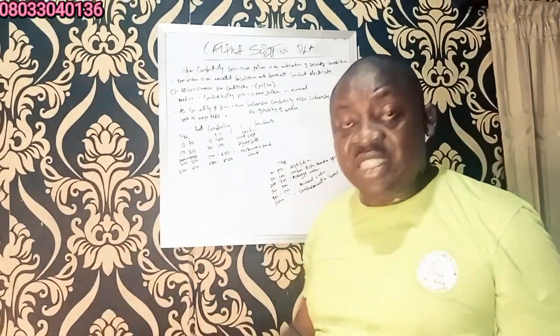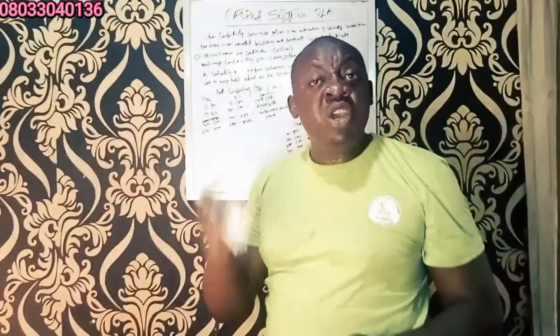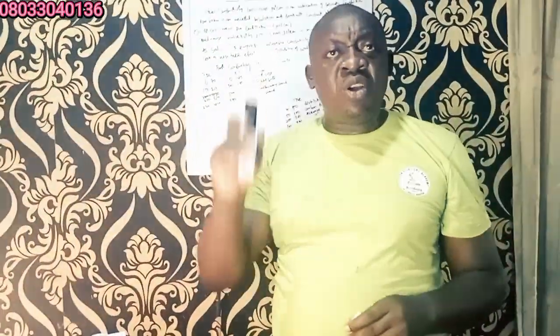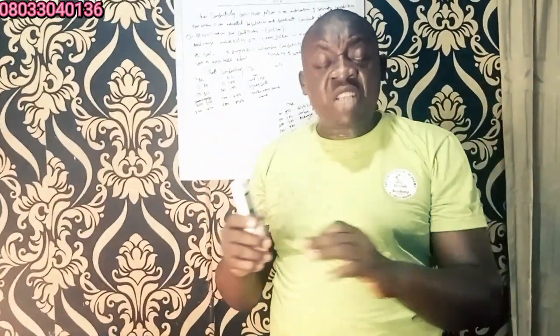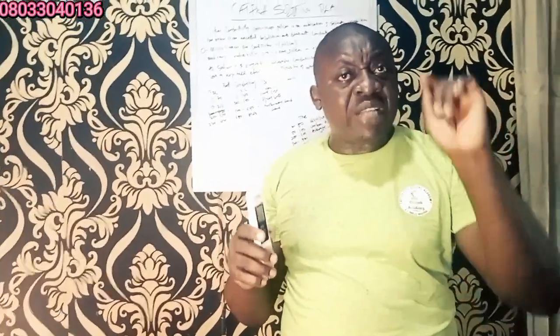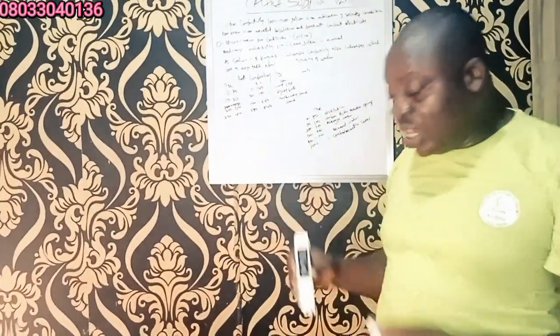and this is not advisable for your fryers or even for your fishes. It's not advisable. So it is very, very important for you to have this. This is 4-in-1. This tests for your TDS, that means the total dissolved solids, it tests for your water conductivity, it tests for your hardiness, it tests for your water temperature. So it's very, very important for you to have this in order to correct those measures.